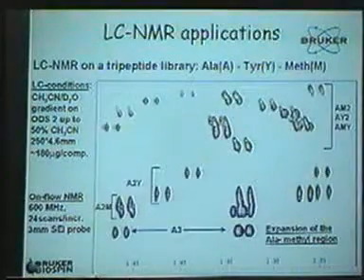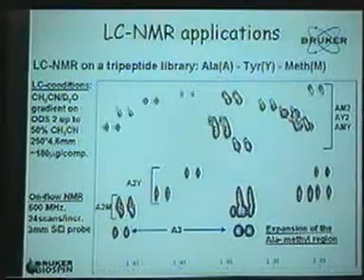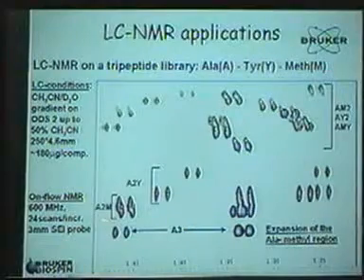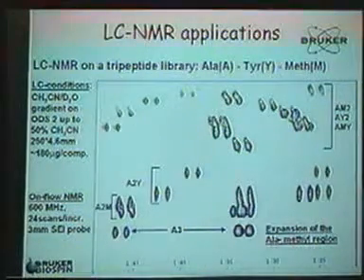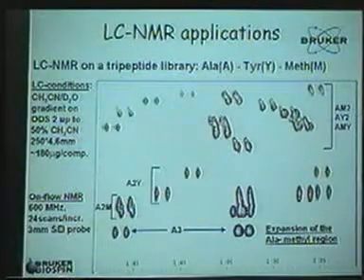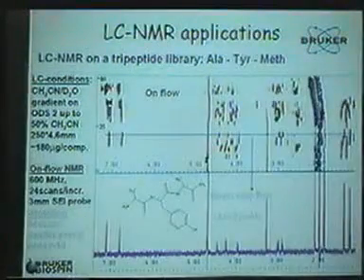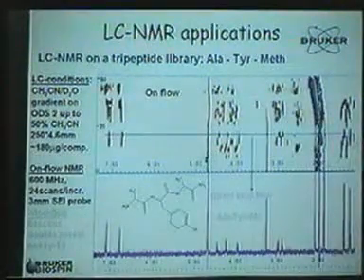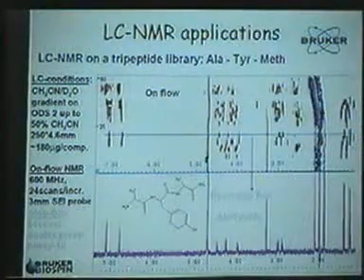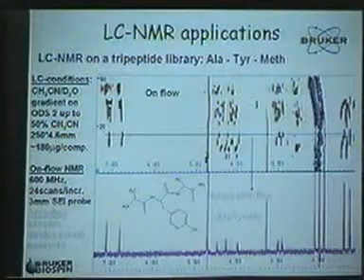If we do a zoom on that, again, this is not an HSQC. This looks like an HSQC, but be careful, this is not an HSQC. These are 1D spectra plotted over time. Okay, you see very well the separation here. I mean, this is a really powerful method. Next. So, for example, if you extract the row corresponding to this moment, you have here the NMR spectrum, the 1D NMR spectrum.